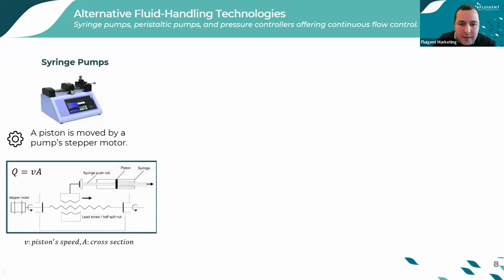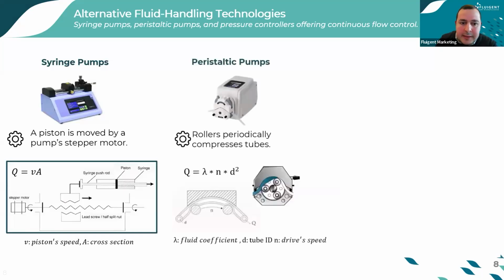So we'll have some errors or a low response time and a lot of pulsations in the flow, which can also affect the experiments that we are doing at microscale. The second option is the peristaltic pump, which usually supports the circulation of fluids, but it can also produce ripple and backflow, again due to the mechanical force exerted on the tubing in order to push the liquid. In this case too, you will have a lot of oscillations in the system because of this mechanical force.